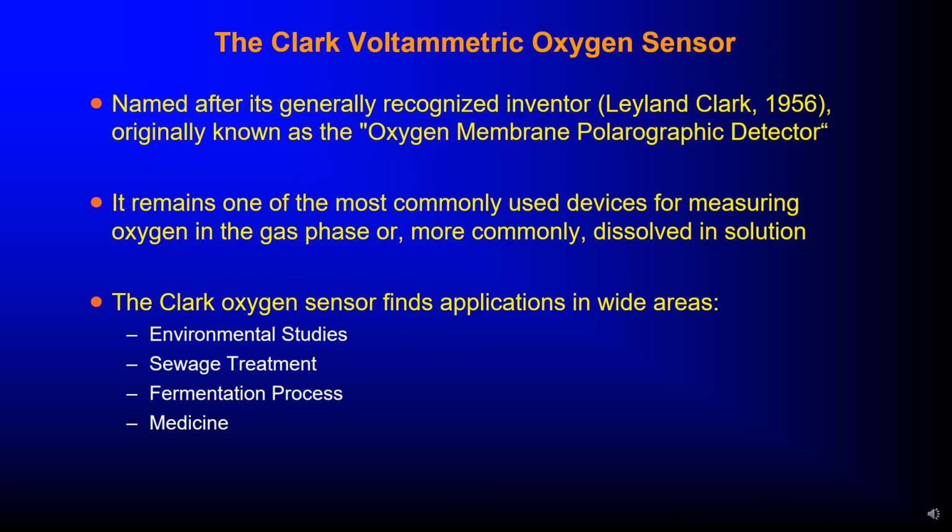Then we have a Clark voltammetric oxygen sensor, named after its generally recognized inventor, Leland Clark, originally known as the oxygen membrane polarographic detector.